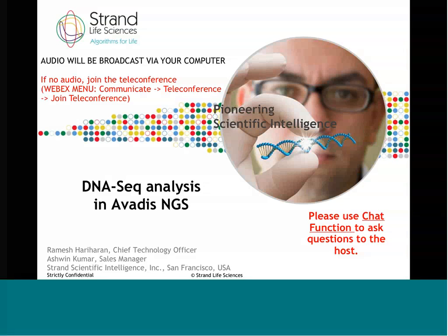What we hope to achieve today is take you through the workflow for DNA-Seq in Avadis NGS and show you the endpoints that you can reach with the software. If you have any questions throughout the presentation, please don't hesitate to ask. The way to do that is to use the chat feature in Webex, and we'll aim to either answer your question right then or at the end of the presentation.